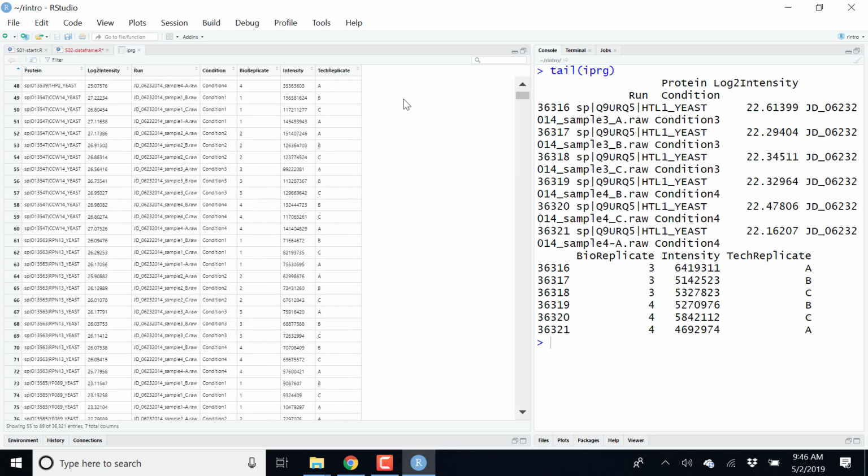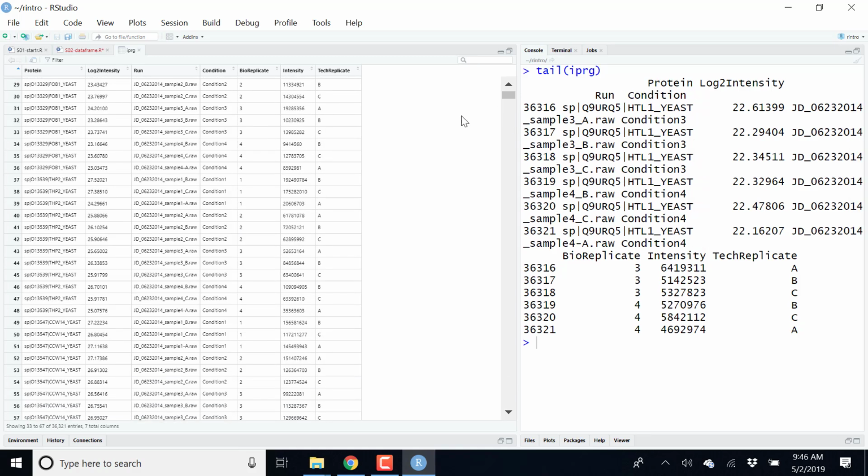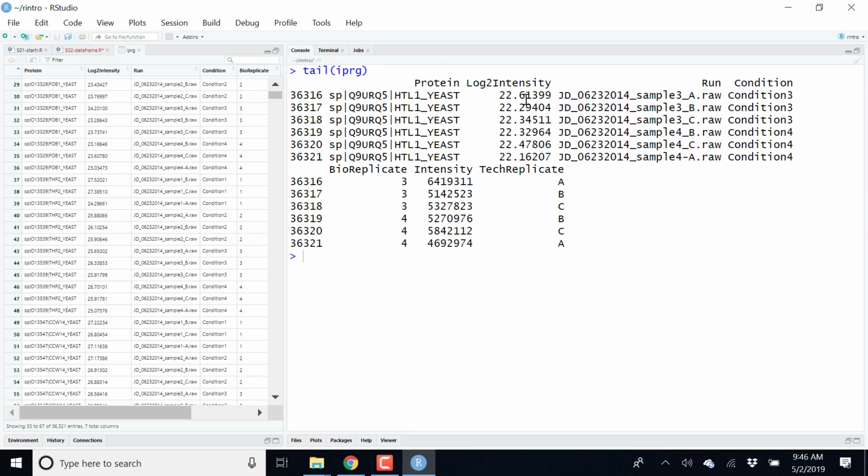Okay. So it's very possible that... What about the other people? Do you see decimal numbers? So here, look, two intensities, yes, but not in my intensities. So you have decimal numbers in your intensities? Yeah. You too? Okay, so there might be differences in the RStudio versions. They might display the decimals.